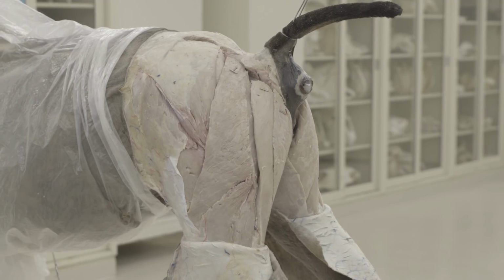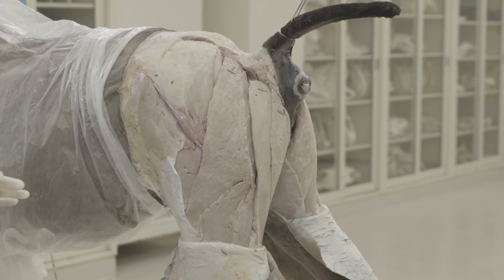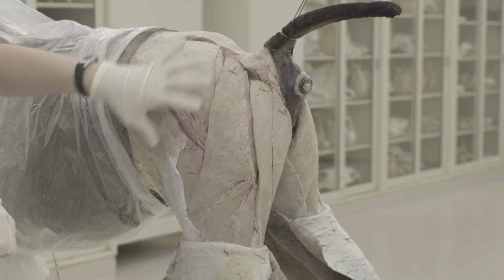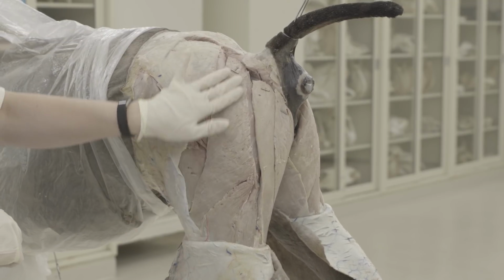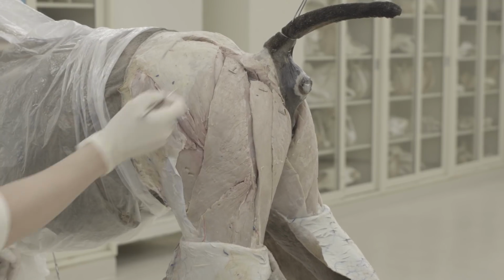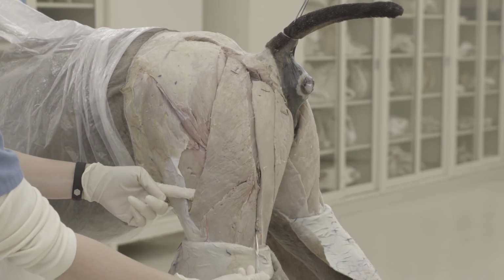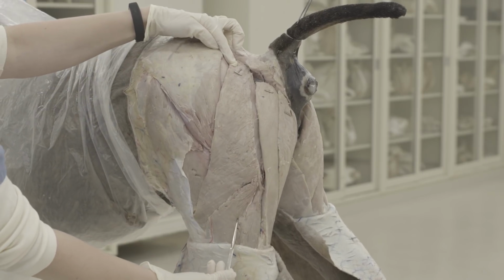So we're starting on the left side with the left limb, and the first thing you're going to look for, there's going to be a lot of fascia covering this whole area, so you really have to look for the borders of the muscles before you start cutting anything. So you want to look for the borders of your biceps femoris, which is this muscle right here, and you want to look for the edges. So you kind of want to define that cranial edge, and then you want to define that caudal edge before you start cutting. So you have biceps femoris here.